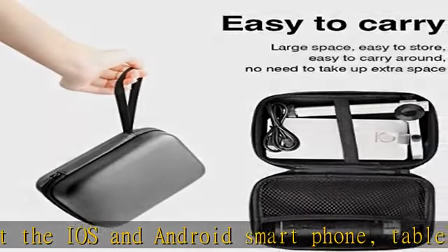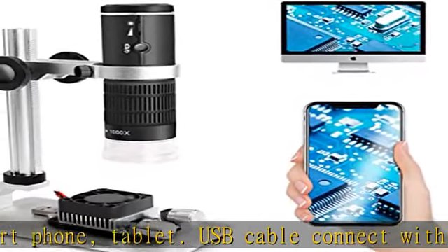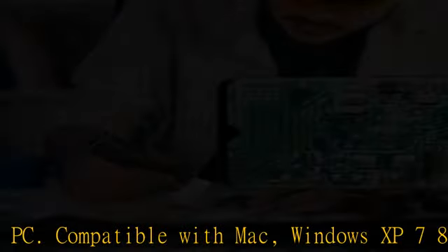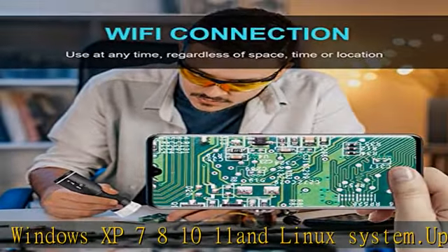Upgraded lens and smart chip allow you to get a larger field of observation and a brighter image. True high-definition 1920x1080p video and 2MP image display. Wireless high-speed transmission with no image delay after full charge.